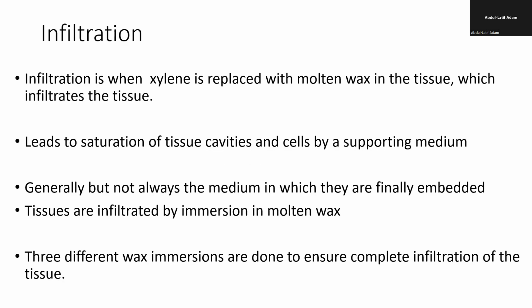So after all that, there are air spaces in the tissue, and these air spaces need to be refilled, because you want the tissue to be in a solid state. That is the whole idea behind tissue processing. It's going to be firm enough to allow what? Thin sectioning. If you have spaces inside, it will be very difficult to cut.